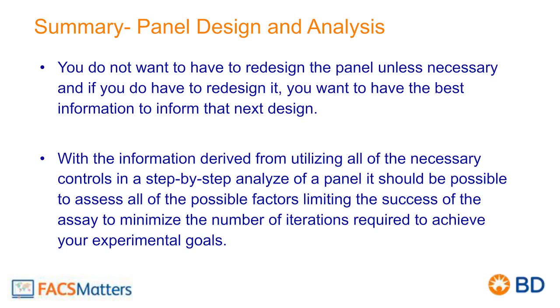Now, I hope this gives you a better understanding of compensation, spread, resolution, and how you can use all of this information to better identify and better characterize the population in your assay so that you can get better biological results. And with that, I thank you, and we'll take questions.